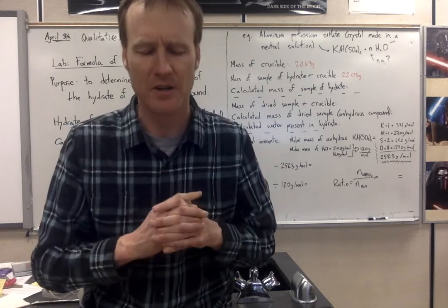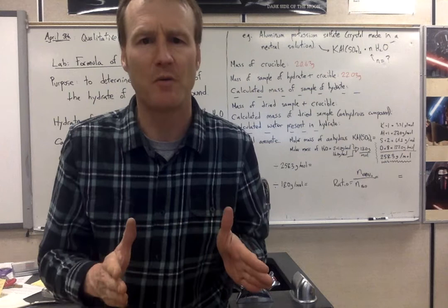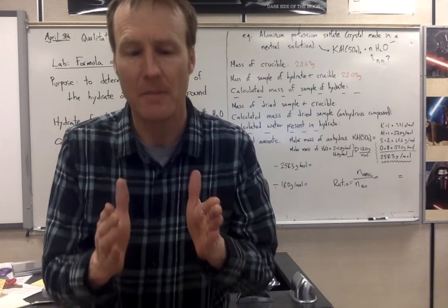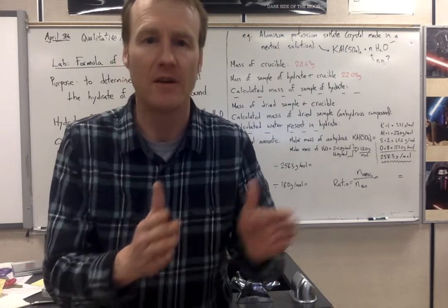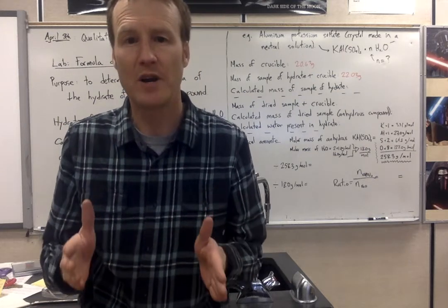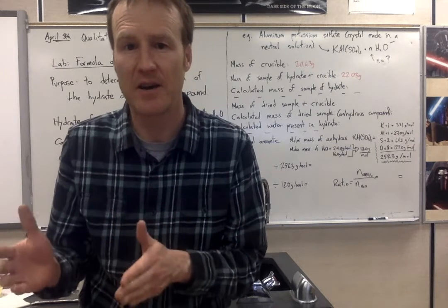Now, what's really cool with this lab is that if you have the formula for the ionic compound, just the ionic compound without the water, and you can measure masses with the hydrate, remove the water, and then measure the end mass, you can actually calculate what the ratio is of water to the salt itself, to the ionic compound.